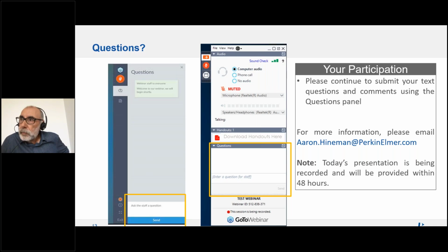Okay, great. Thank you. And then we have someone wondering if you could share some thoughts and experience in field flow fractionation ICPMS coupling. Well, our experience with FFF ICPMS is that it's not an easy technique, because I think the problem is not the hyphenation, but handling AF4 properly, because there are a lot of things to bear in mind and to control.